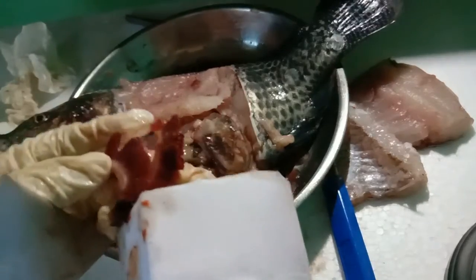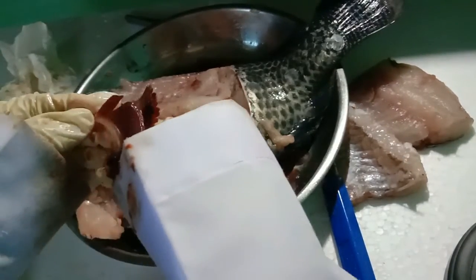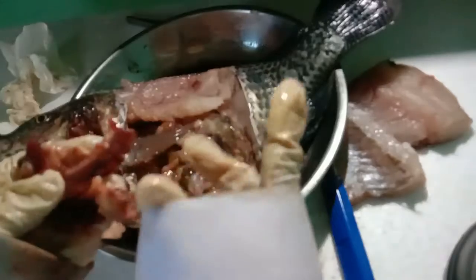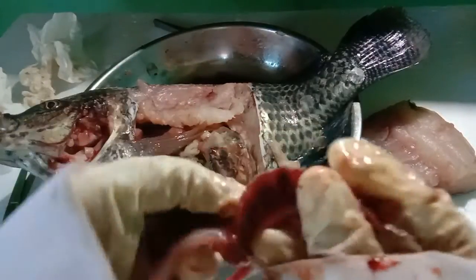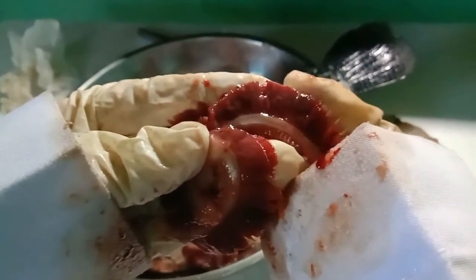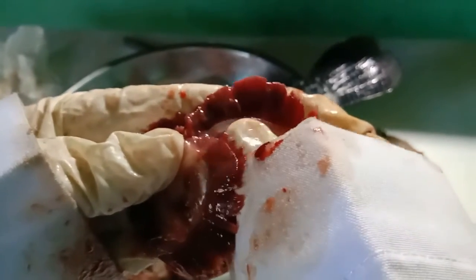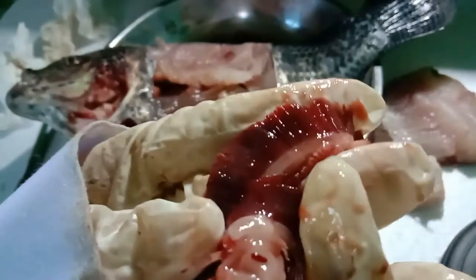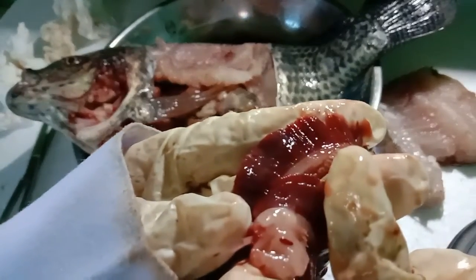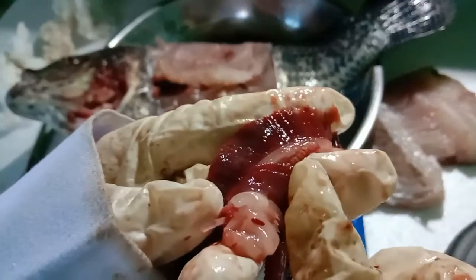The structure of the gill consists of gill filaments, which increase the surface area for gas exchange. So you can see the gill structure here. These are the gill filaments, and this bold white is the gill arc. And this tiny structure here, like teeth, is the gill rakers.